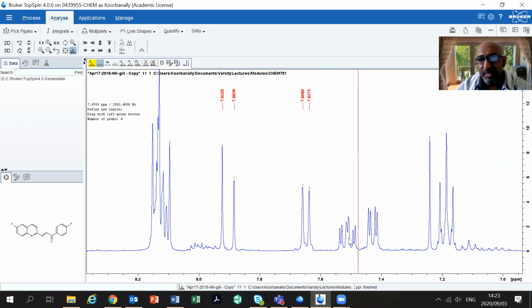If I want to take these two peaks here, I can choose both together. I can see 6 peaks here. I can either start to choose them individually, or I can choose the 6 together. I'll just choose the 6 together now. So that's for those 6 peaks. I can choose these 4 for the double doublet. This is my chloroform peak that should be at 7.24. I can either choose to let the reader know that it is at 7.24, or I can leave it out, cross this peak out and say CDCl3.